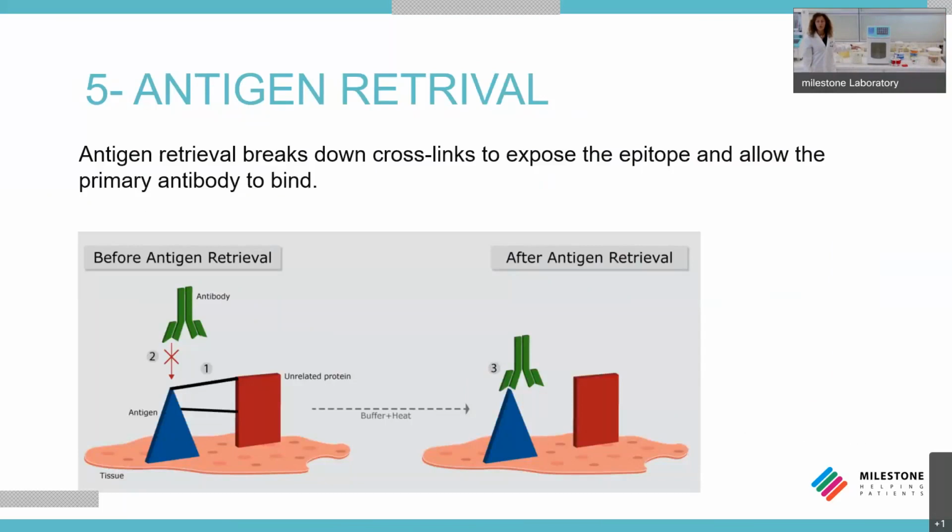The value of immunohistochemistry is due to the power of this procedure to recognize and localize specific proteins, markers, within a tissue specimen. A variety of heating sources, including microwave, vegetable steamer, pressure cooker, and water bath, have all been used successfully for the antigen retrieval.